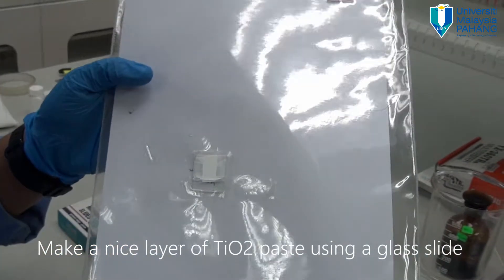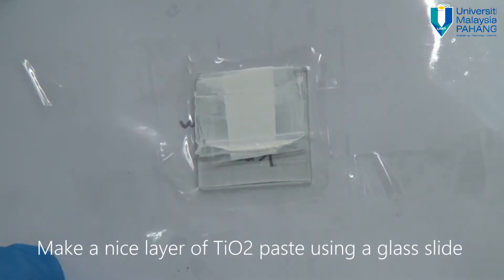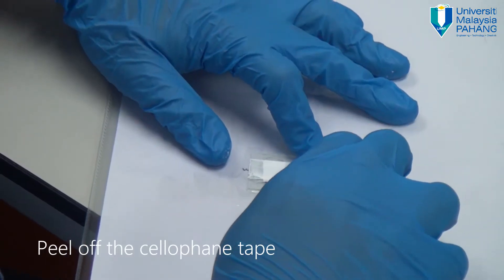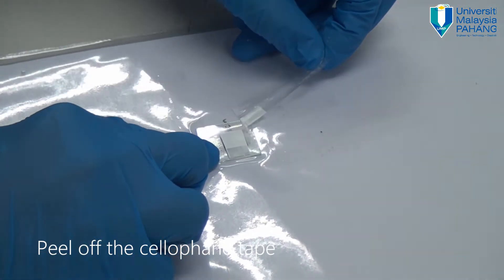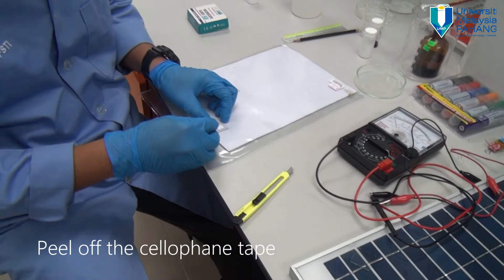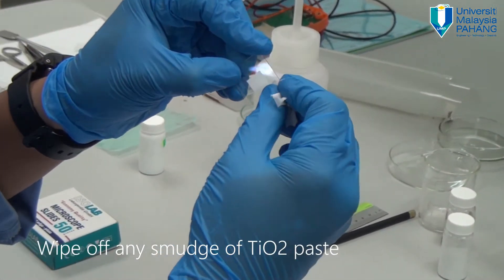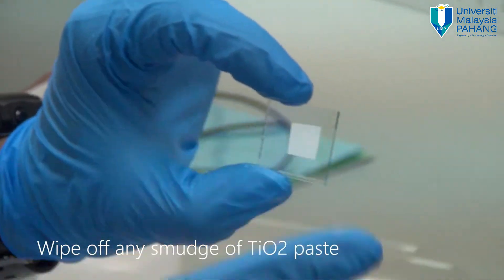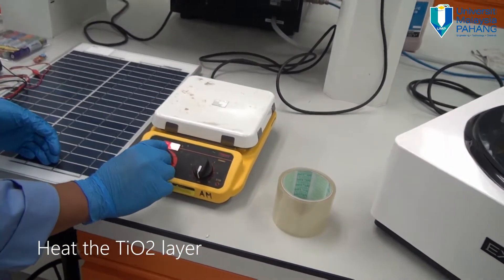This is considered a nice surface of titanium dioxide. The next stage is to peel off the cellophane tape — quite tricky because it sometimes attaches to the other side. This is how the layer of titanium dioxide is supposed to be fabricated. Wipe off any smudge of titanium dioxide, being careful not to touch the center. It's not supposed to be exactly square — something like this is acceptable.